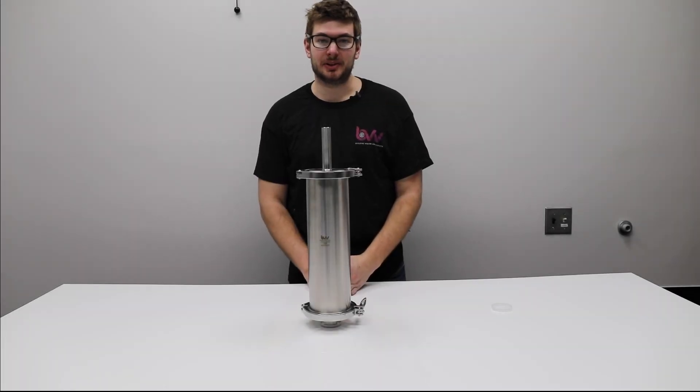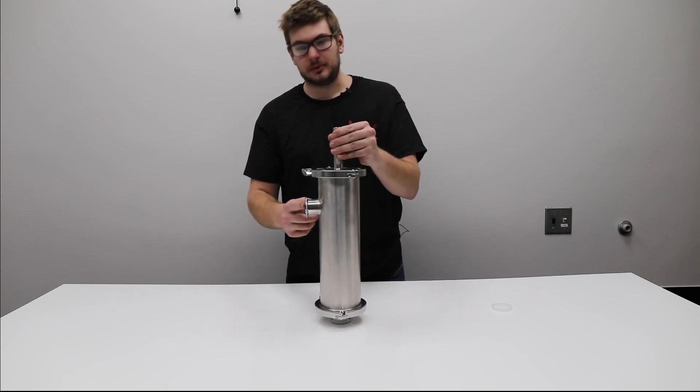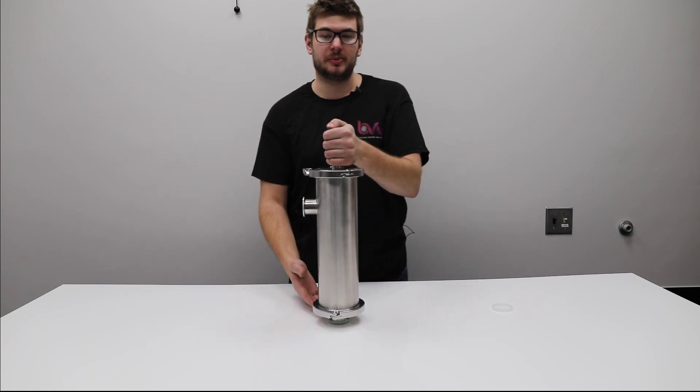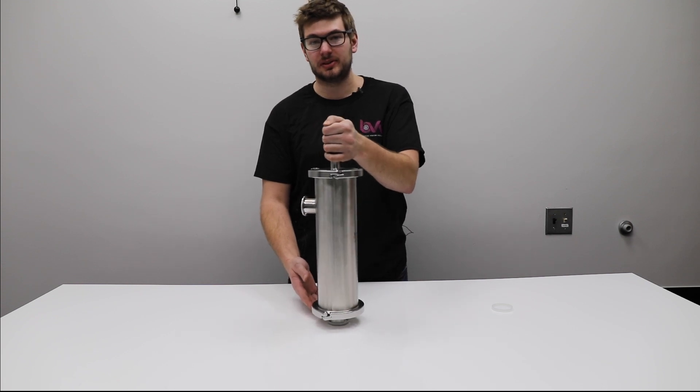Hi everyone, we're here at BVV today with a new product. We have this inline strainer, so you can see a 1.5 tri-clamp here, same with the bottom. You can flow both ways and it's just going to take out particulate that you might have in a mixture, such as after a centrifuge extraction or something like that, a filtration of some sort.